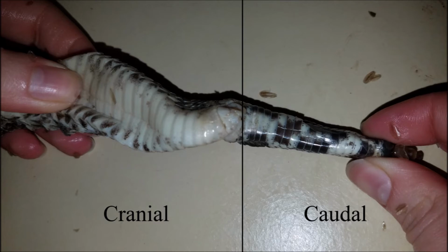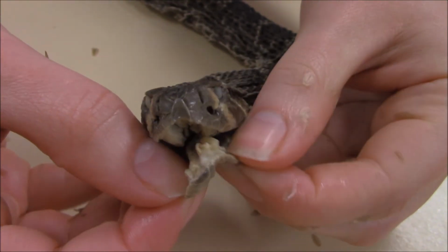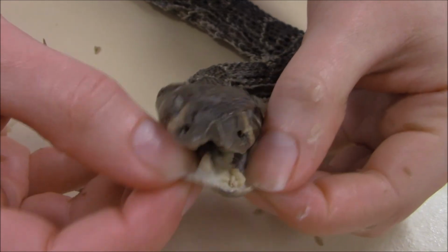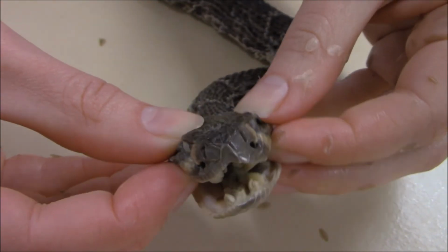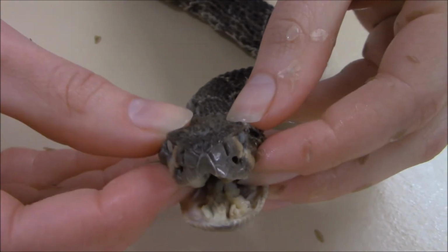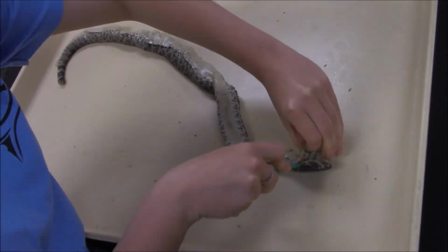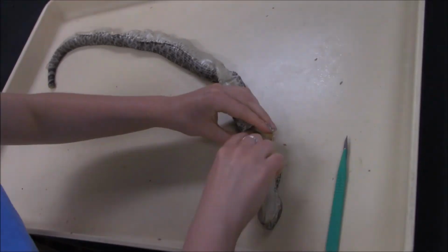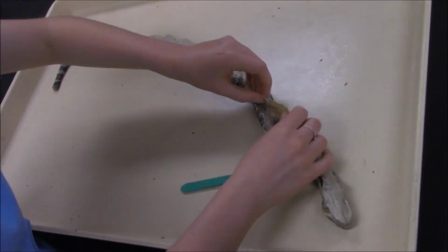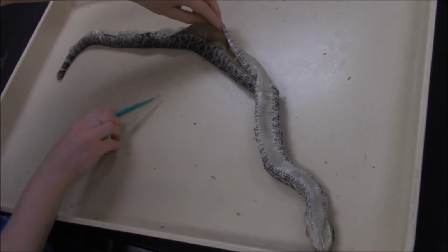Another external feature that all snakes have is a kinetic skull. As you can see here, the dentary bone and the cranium are both non-fused, so they can be moved around, which will accommodate consuming large prey. To dissect these snakes, we did a ventral slit along the side of the body, just so that we could fold it open without destroying any large features.